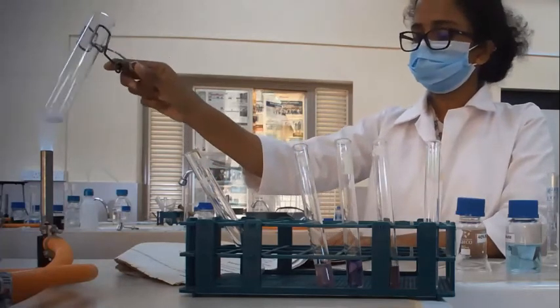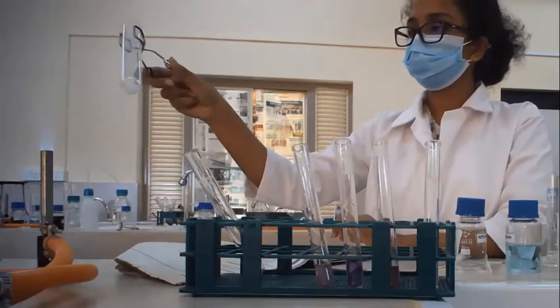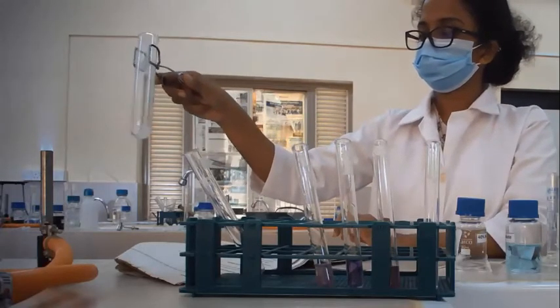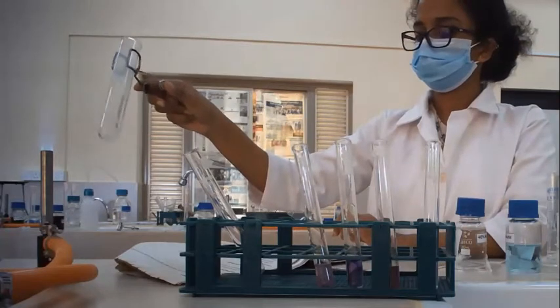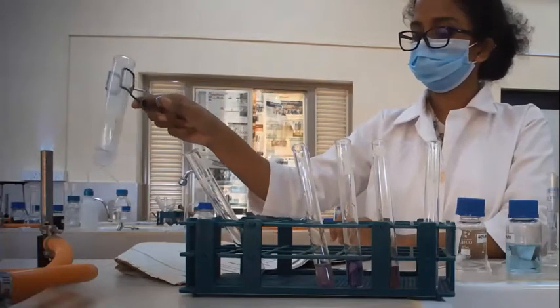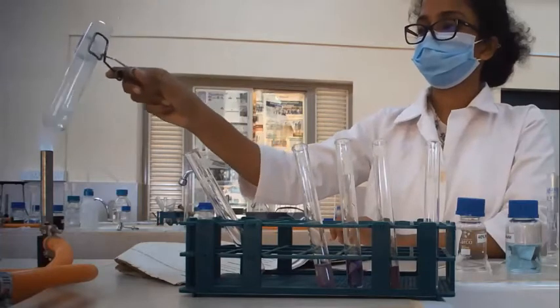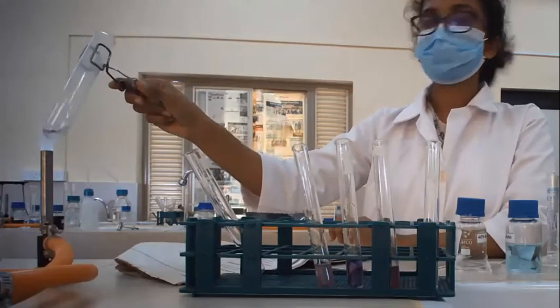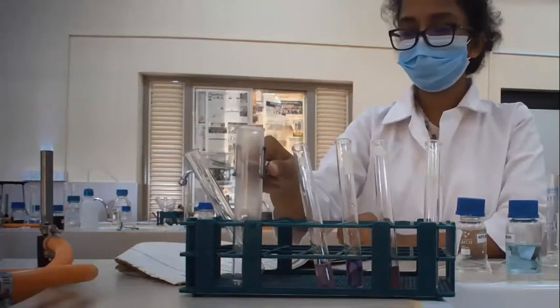When we heat, the residue is a biuret. We are going to heat this for a few minutes. And now we have heated it and the residue is a biuret. And we are going to allow it to cool for a few minutes.